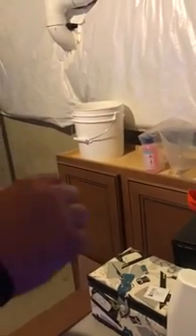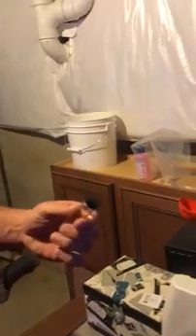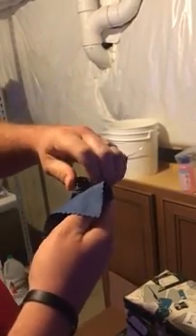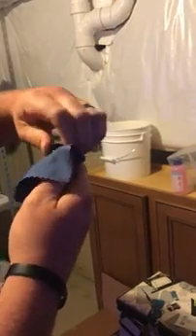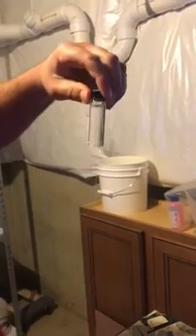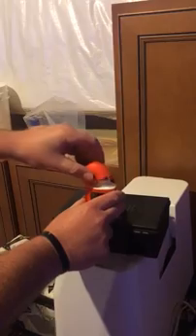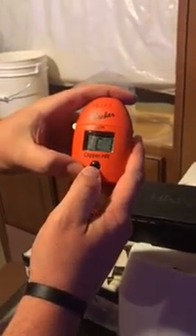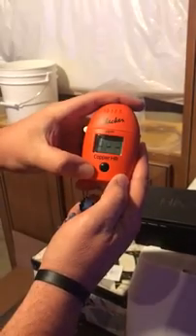Hanna says make sure when you are doing these tests your cuvette is, number one, clean — I do have their cleaning solution, though I haven't had to use it yet because mine still look crystal clear. So clean and dry, no air bubbles. It does use light to read the sample.